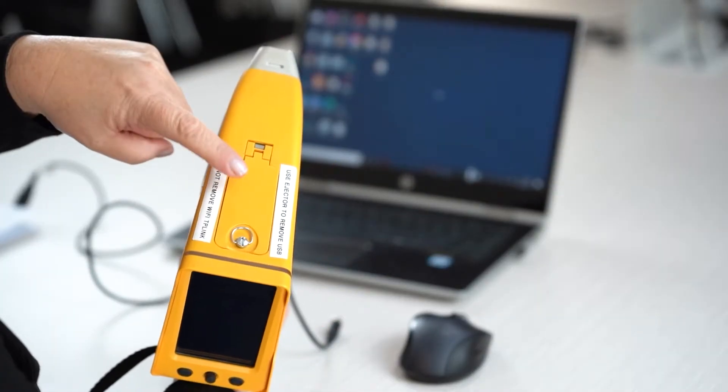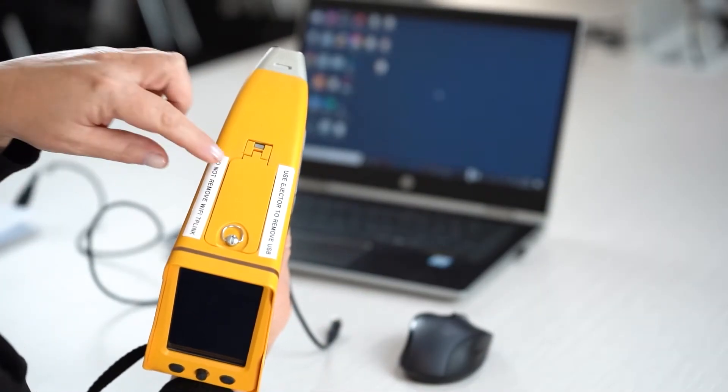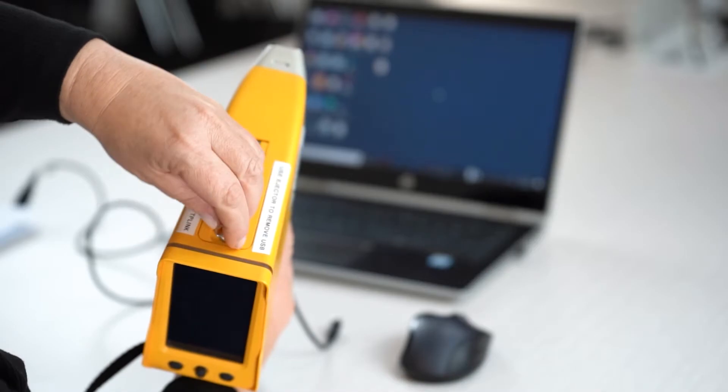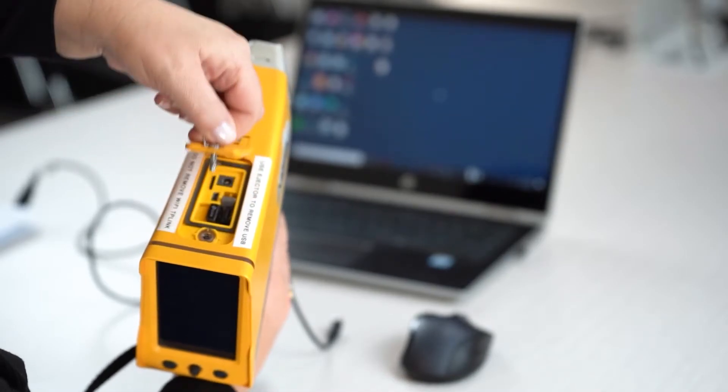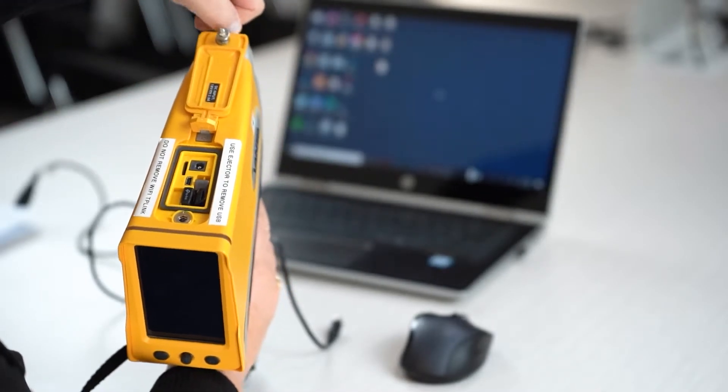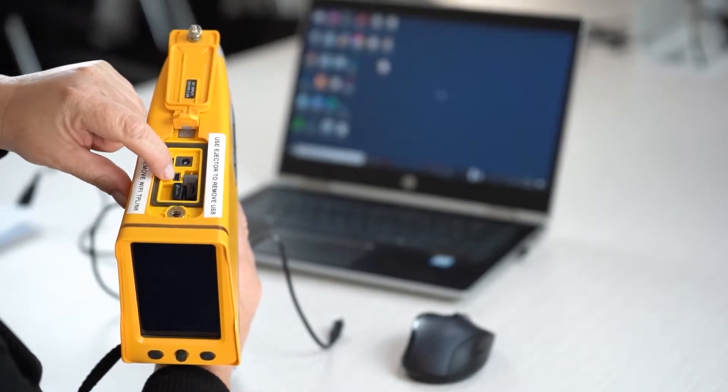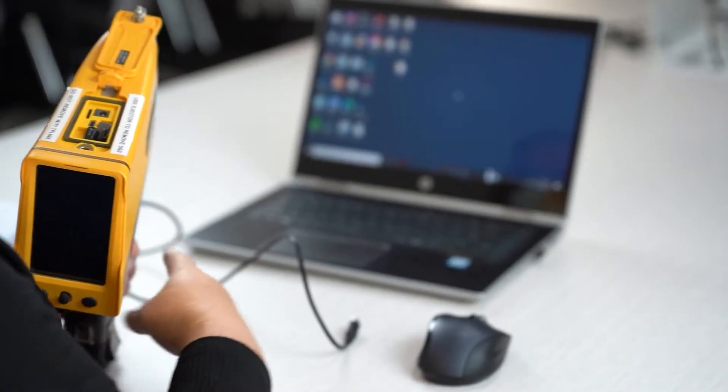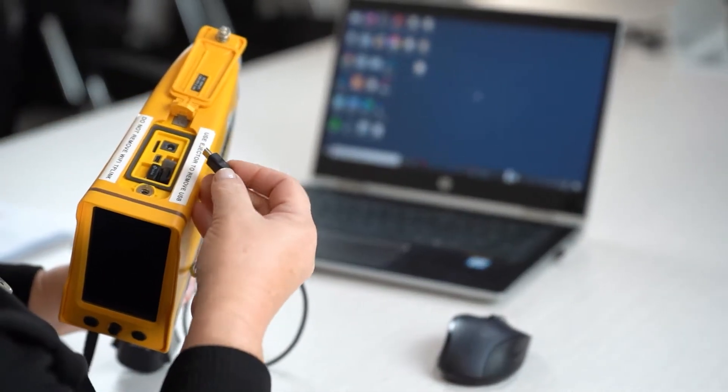You have to locate the data port cover. You need to get the pull ring, twist it anti-clockwise and open it. And then in here, there's a place to put the USB cable. Put it in.